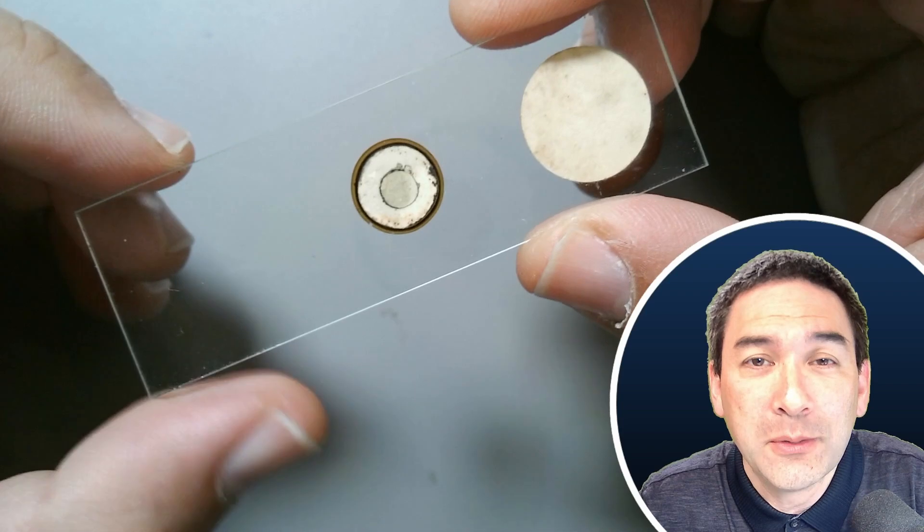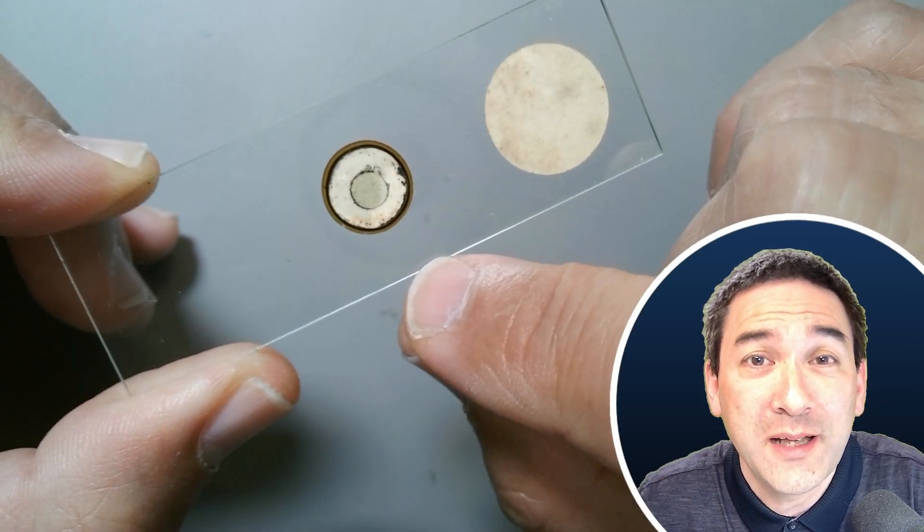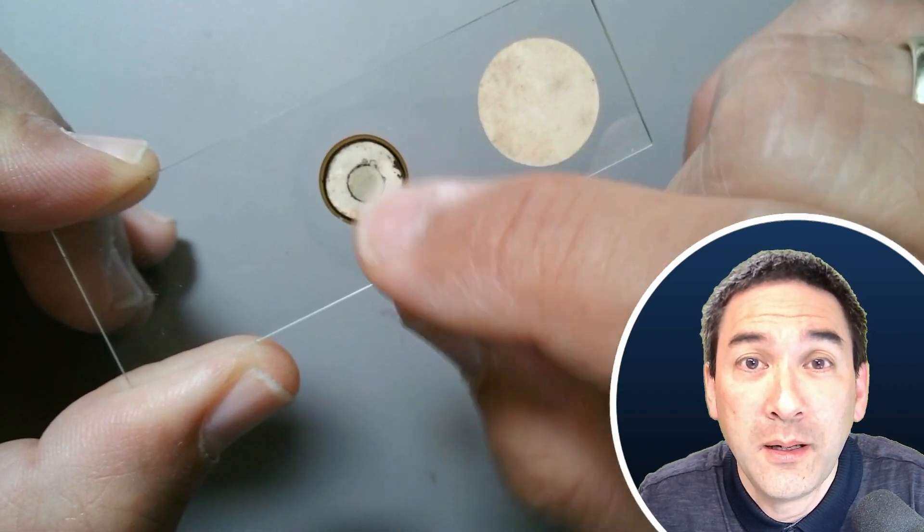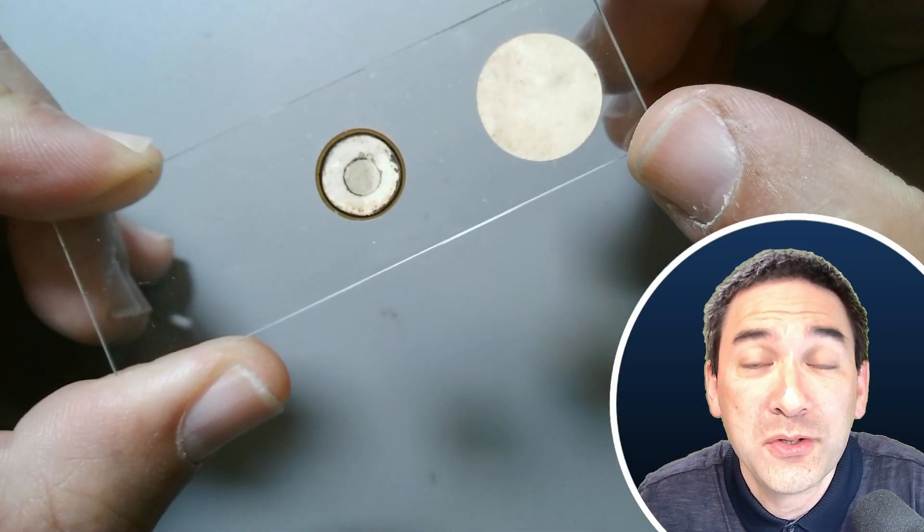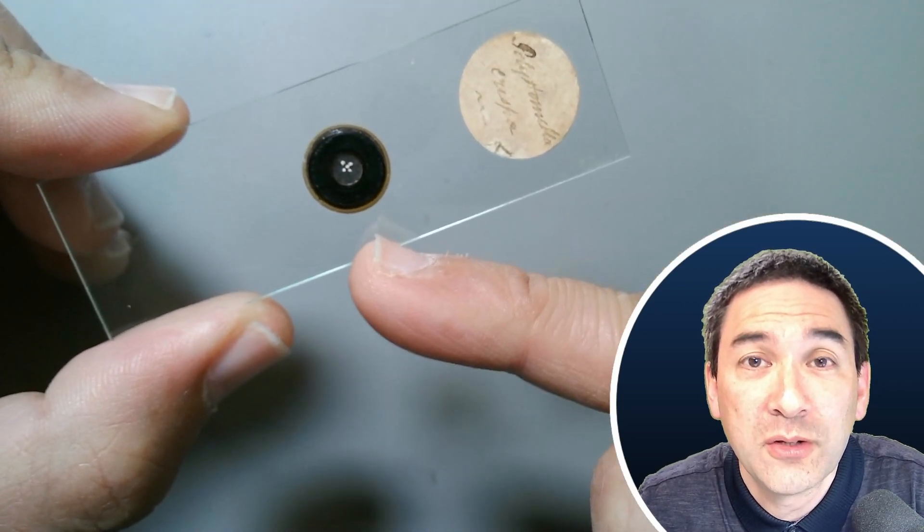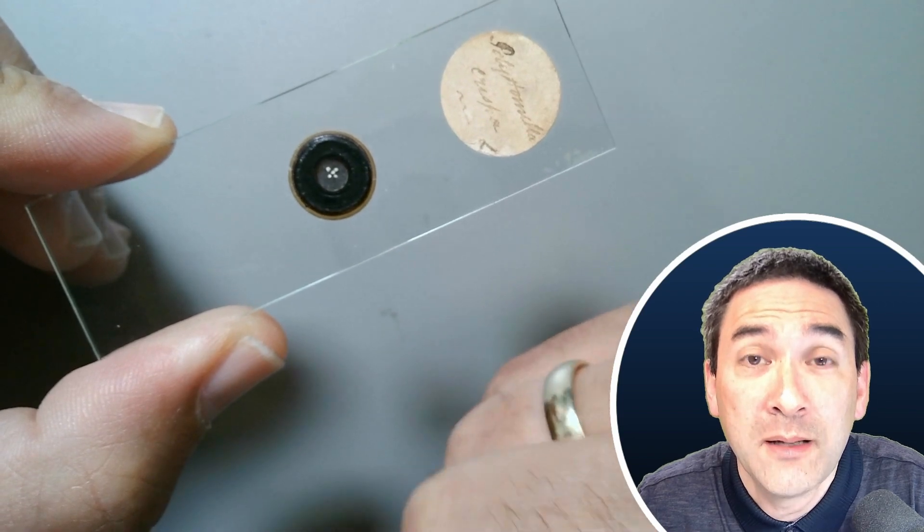Now, when I turn the slide around, we're able to see that essentially it's not transparent. Normally, microscope slides are transparent, but this one contains paper to give it a black background. So that's the reason why those white tiny foram shells here are better visible on the black background.